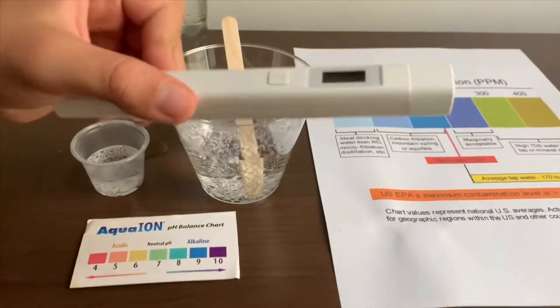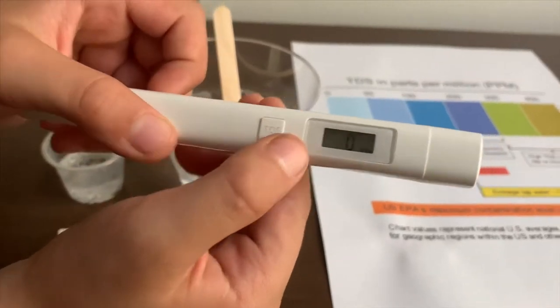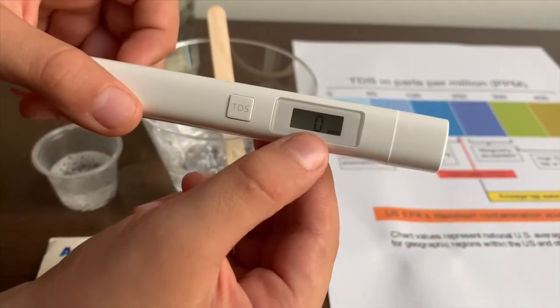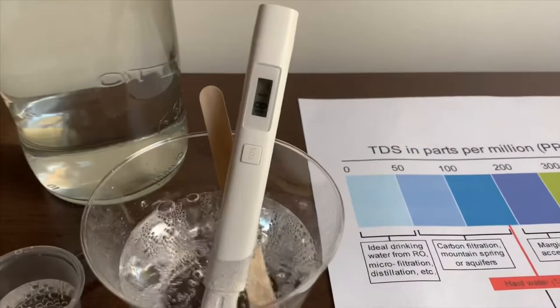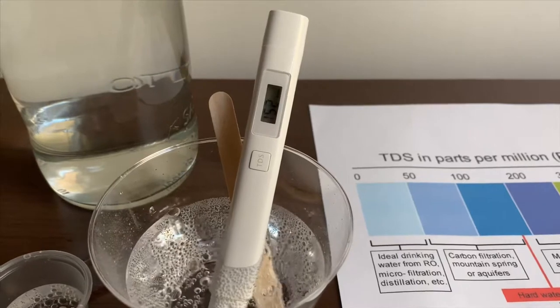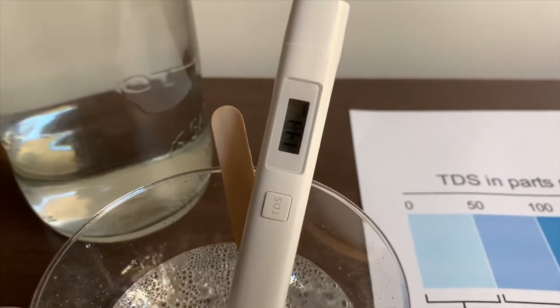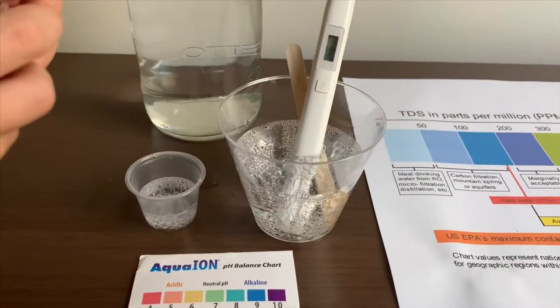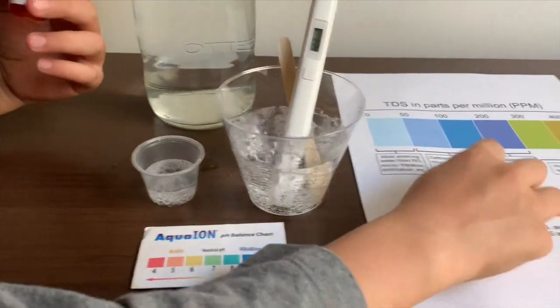If you want to buy this TDS tester, the link is down below. Turn on the TDS tester and make sure it says 0. Let's put it in. It's in the 100s — so that is okay to drink.